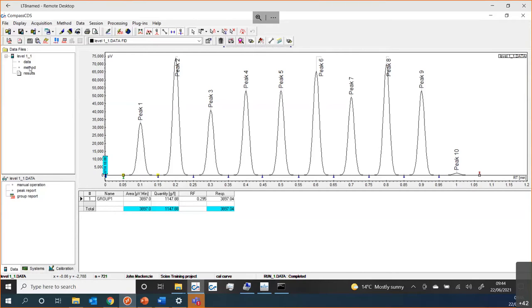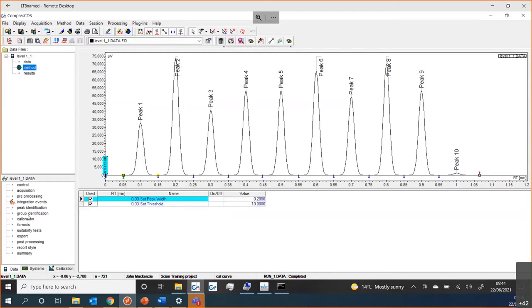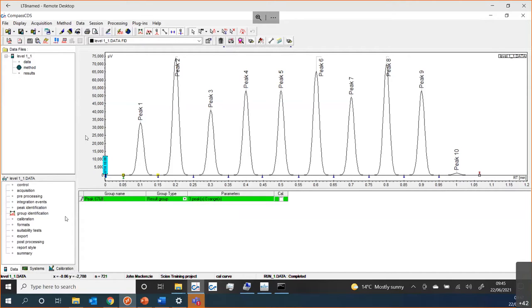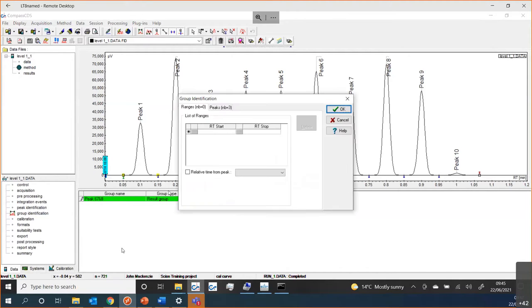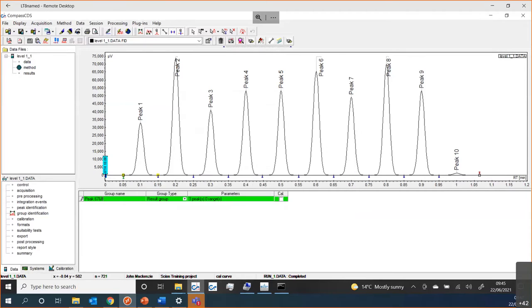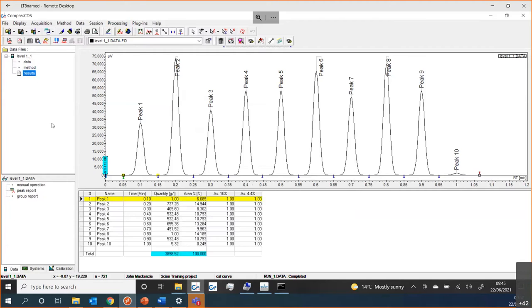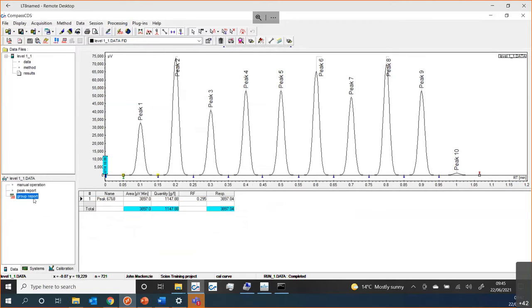Maybe I want to give that a better name, so I could go back to my group identification and call it peaks six, seven, and eight. Once I've entered that, I can reprocess and it should update into my group report. You can very quickly build up a method and change what that method looks like.